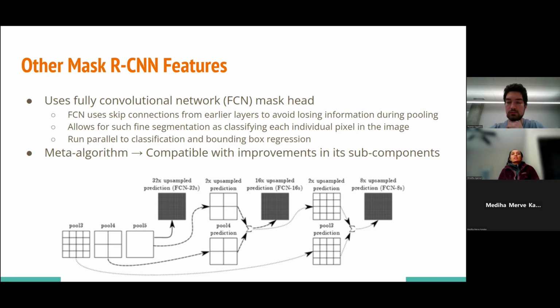Yeah, because generally, have you heard a little bit about YOLO? There were many presentations in the past 2 weeks about YOLO. There they are using an algorithm. When you have the masking, semantic versus instance segmentation is happening. That means you're classifying pixel-wise. What I'm trying to say here, and the other thing in YOLO, is that you train the object when you start training the data. So if I give you the void data, you literally provide a bounding box around the void as training data. Now in Mask R-CNN, are we doing the same thing? We are giving the data as the bounding box, and also there is a masking. What is the input data?